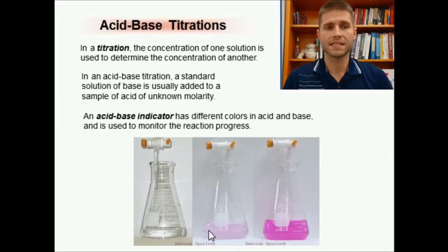There's no more acid left. We've eaten it all away. And so the color starts changing because the phenolphthalein indicates when you're in a basic solution. So once we've eaten away all of the acid, the H plus from the acid, we're going to start changing this into a basic solution. And here we can start seeing the color change. Not very apparent, but it is a slight color change.